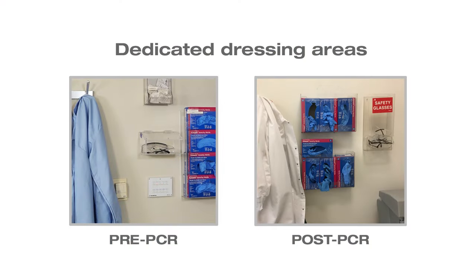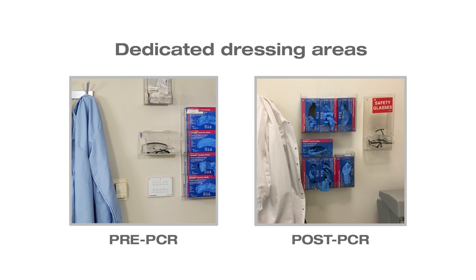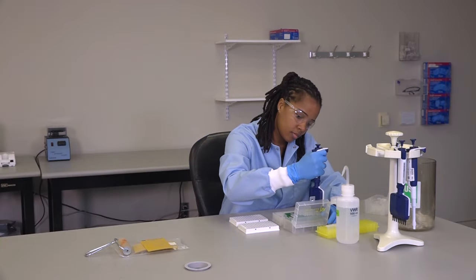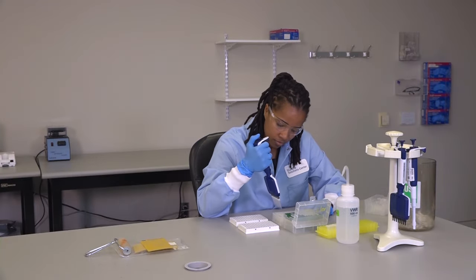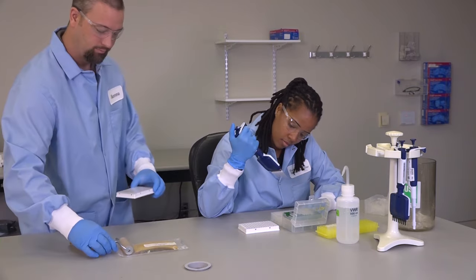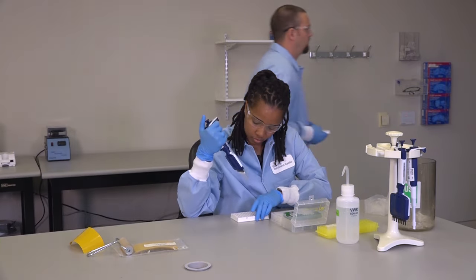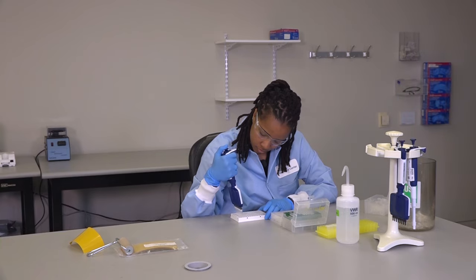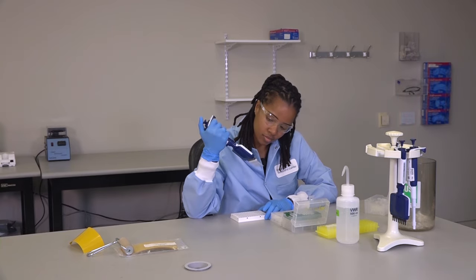Additionally, use dedicated dressing areas near the entrance and exits of both the pre- and post-PCR areas where PPE can be applied or removed before entering or exiting either area. Sort and aliquot all reagents shared between pre-PCR and post-PCR in the pre-PCR area. Carry post-PCR reagents to the post-PCR area after they have been sorted in the pre-PCR area.